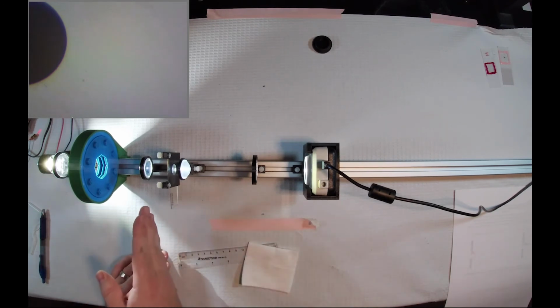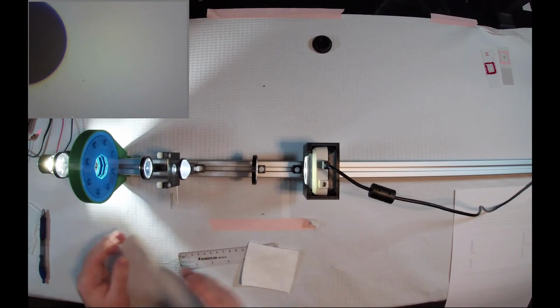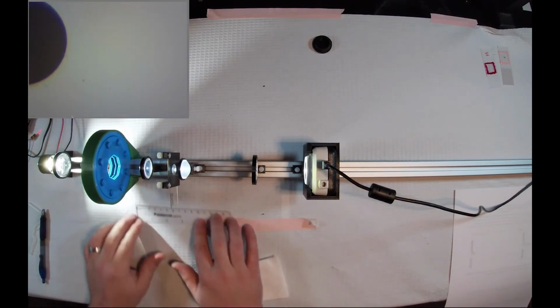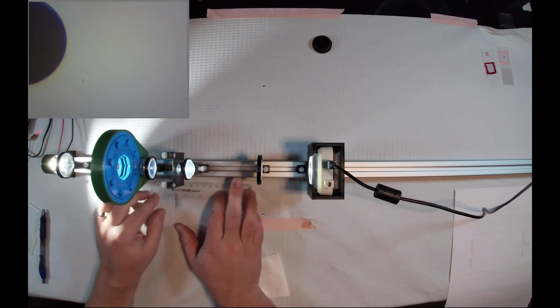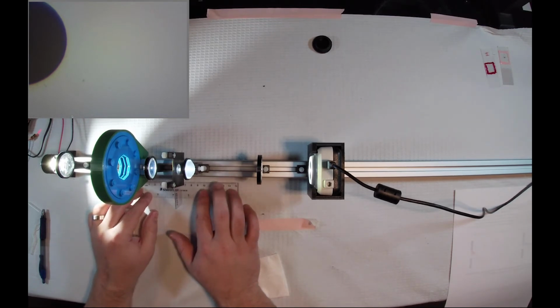And we have a condenser whose front focal plane is mounted at the sample. So we should intuit that the back focal plane of the condenser, which is again going to be roughly one focal length away from our condenser, to make sure that we measure that, it should be about 35 millimeters.